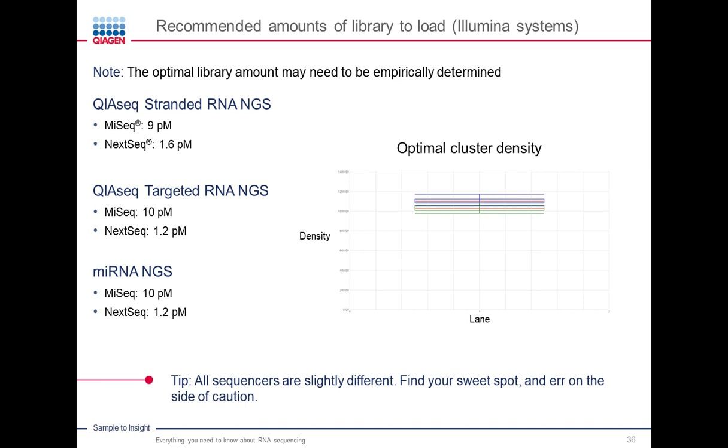Even if you have optimized your amount of loading and you then move to a second sequencer, all sequencers are slightly different. Be sure to find your sweet spot for the loading and err on the side of caution.